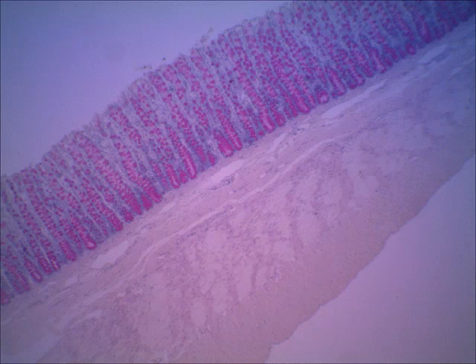That's actually mucus that's produced by goblet cells within the mucosa. There are lots of goblet cells in these glands that at first glance this may look somewhat like the stomach because the surface, again, is rather uniform, but the gland itself pretty much goes just straight down, and it is loaded with goblet cells. And so that's how you know this is the large intestine.